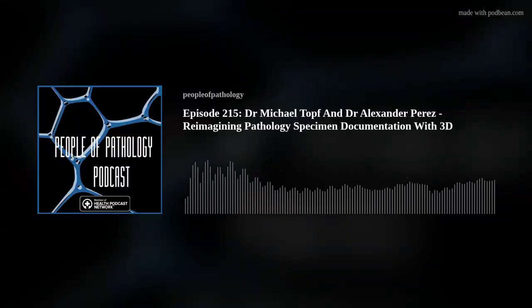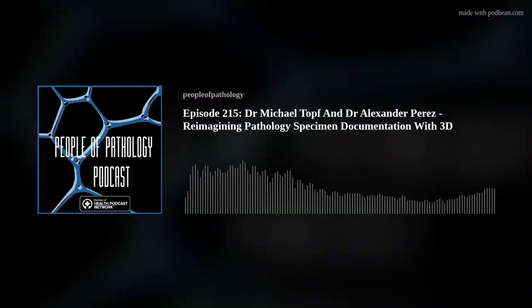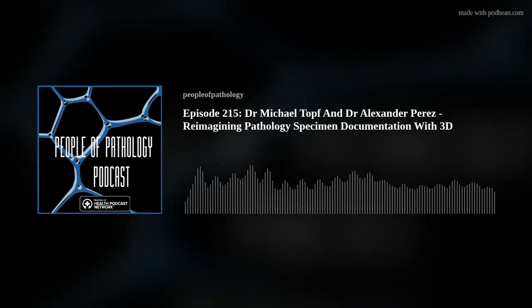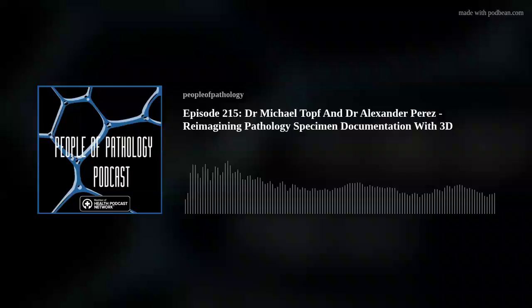Tumor board, this is definitely something we do as well. We'll show these models at the tumor board. If you're saying the margin is less than 0.1 centimeters, you could just show them, hey, here's the slide. This is what I'm seeing. This is the exact spot on the specimen where it came from. And so if they're planning to re-resect, you can be much more granular with where you're telling them you're positive. You're not saying, oh yeah, it's somewhere on the medial. You're saying, hey, this is block M. I'm showing you exactly what it relates to.